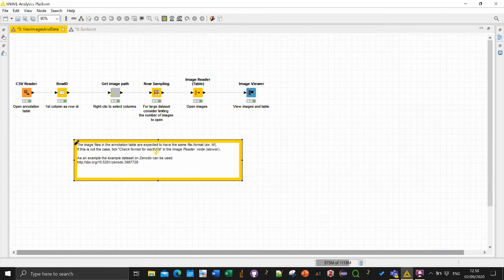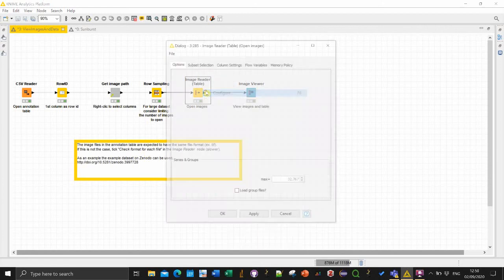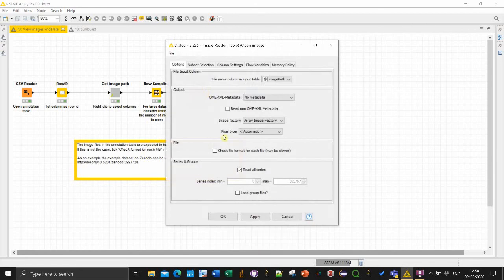So if you had a multi-dimensional image I think that would work too here you would have some slider for the channels and so on. In my case I just have single channel image so it's quite straightforward. Yes one thing I didn't mention.